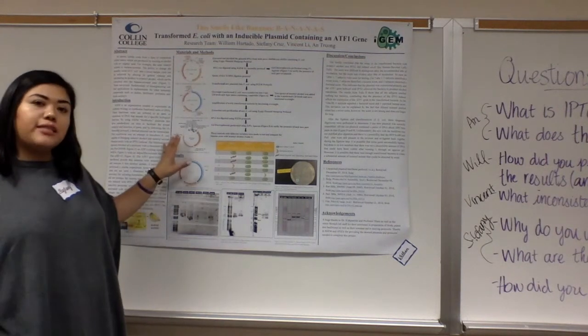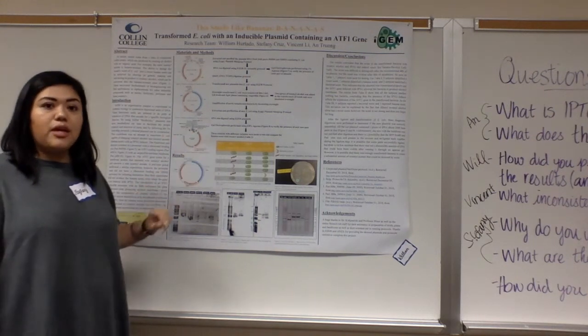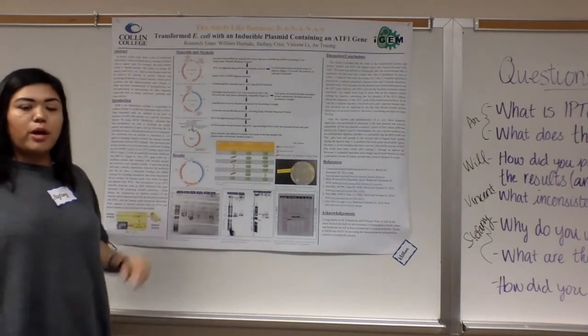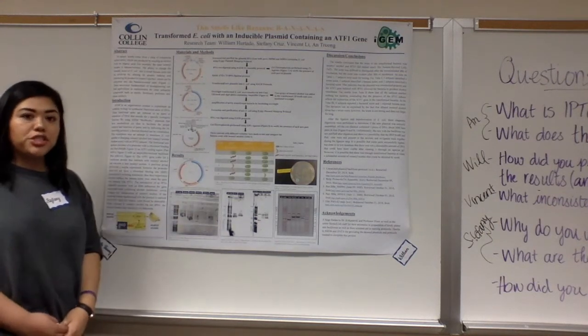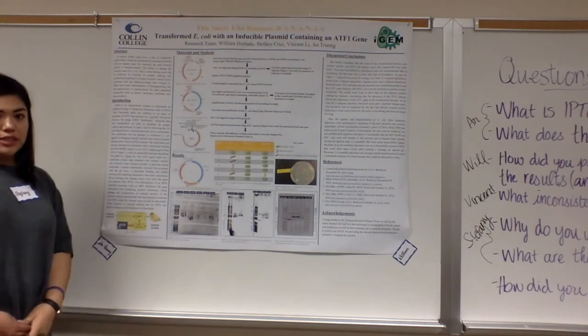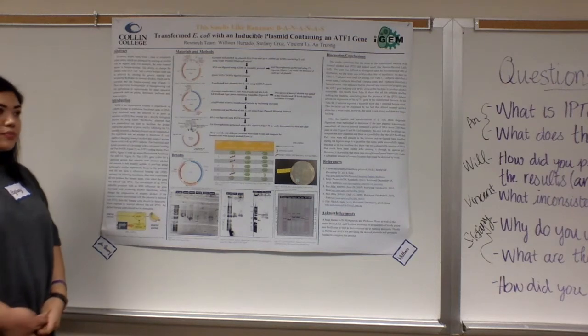We then linearized the ampicillin-resistant backbone with EcoRI and PstI to produce our desired plasmid containing the proper parts. After digestion, we ran each part through a gel electrophoresis to confirm that we indeed cut at the proper sites.